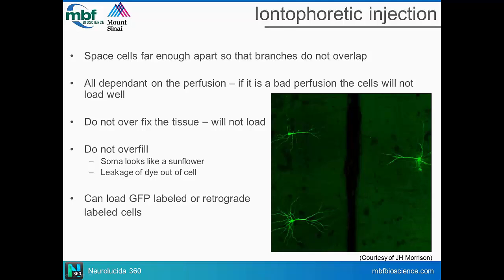It's important you don't overfix the tissue and you don't overfill the tissue, or else you'll have a lot of leakiness and some ghost cells around it, which again will make it more difficult to reconstruct in 3D.